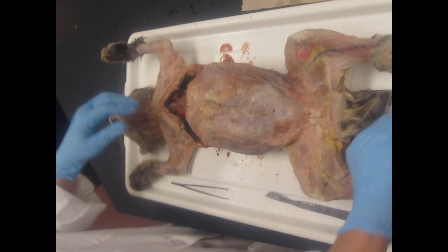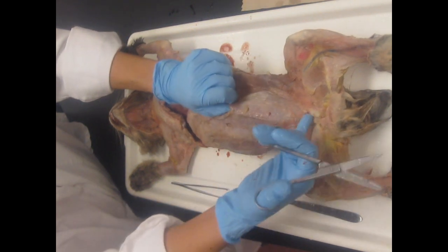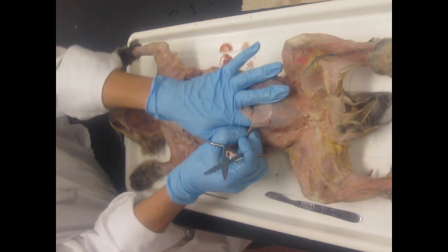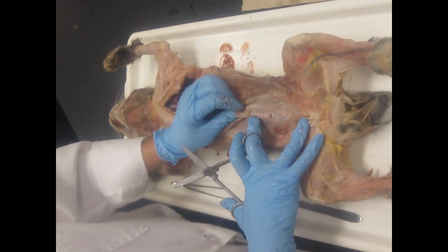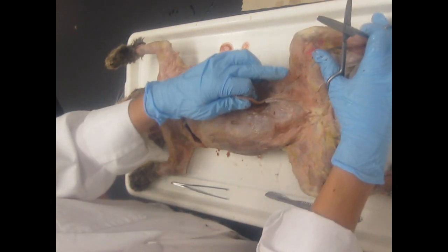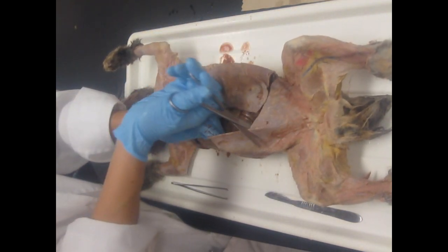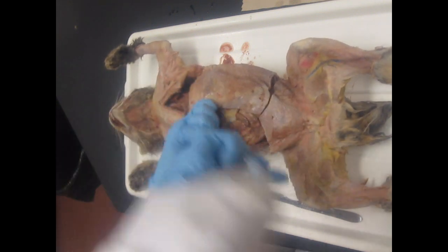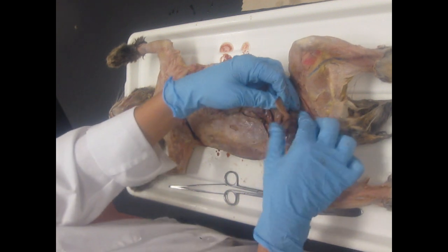Okay, the next thing you're going to do is continue your abdominal incision. You don't want to go all the way to where the abdomen ends, because the bladder of the cat is actually attached to the abdominal wall. So you're going to leave about 2 or 3 inches above the end of the abdomen, and then go to where the hip is, or where the leg meets the body. That way you don't cut through the bladder.